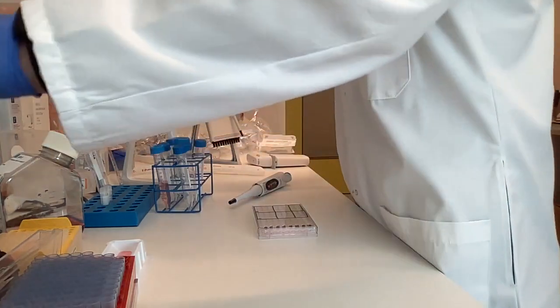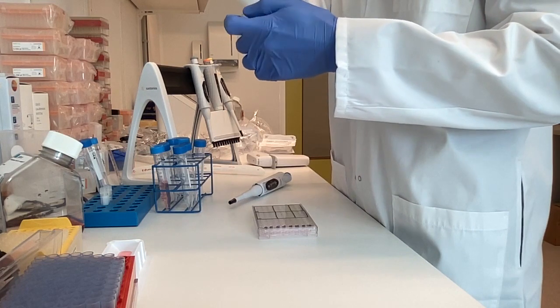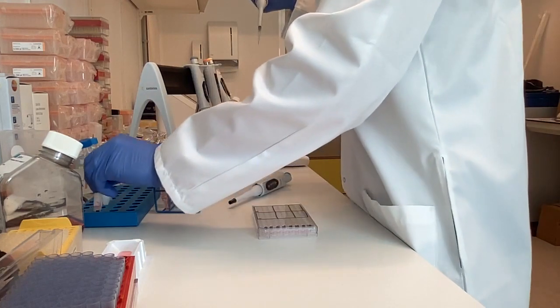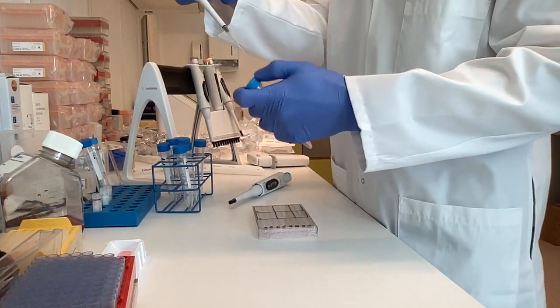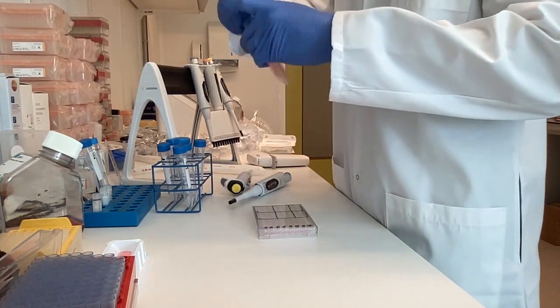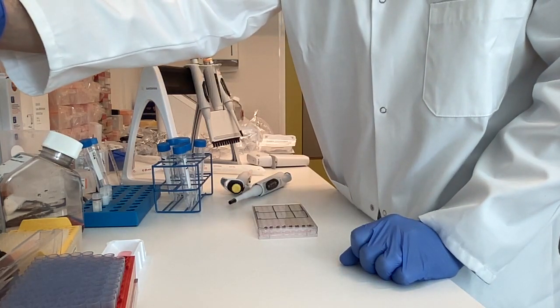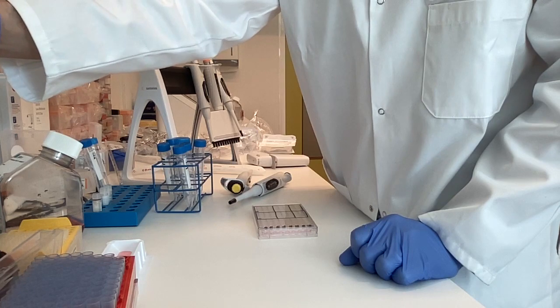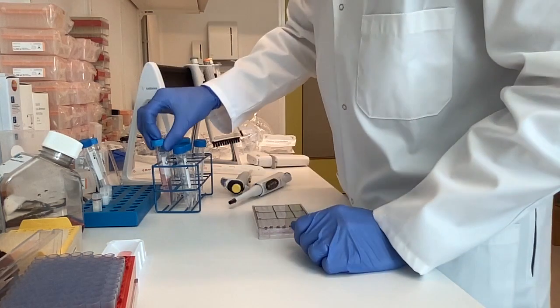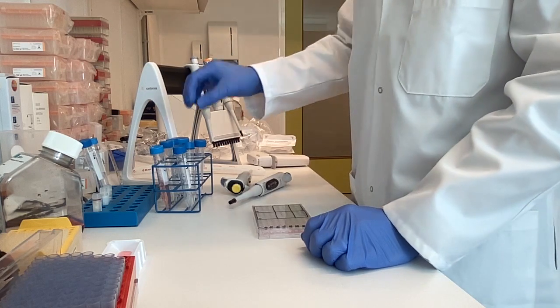Before I use it, just to be sure, vortex it. Take out 30 microliters, add it in your R3 tube, and vigorously mix the R3 solution by vortexing it for 1 minute at least. So we've prepared our R3, and the next step will be preparing your non-spiked sample dilutions.